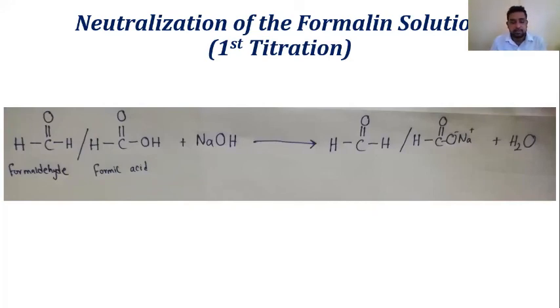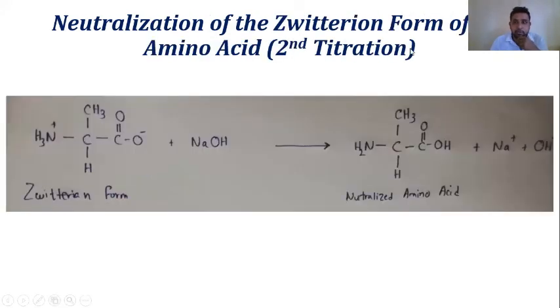If you have any questions, please ask. I will go step by step. Then I will move on to the second titration, that is the neutralization of the zwitterion form of the amino acid.